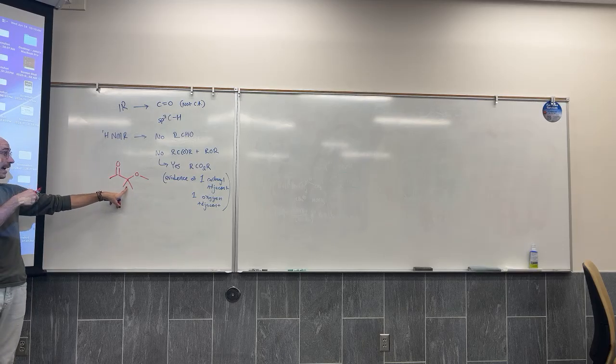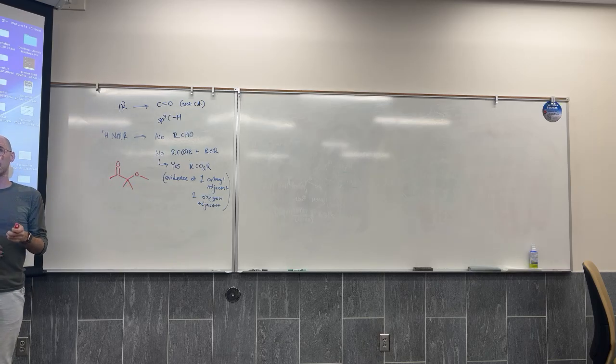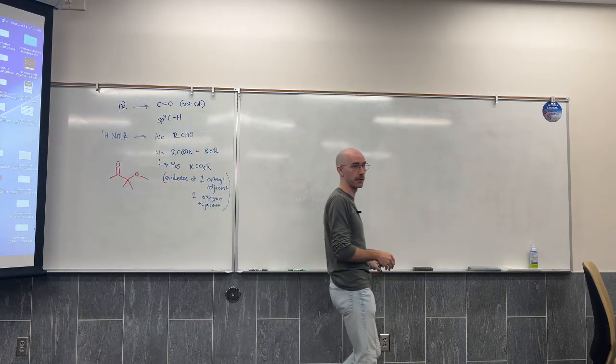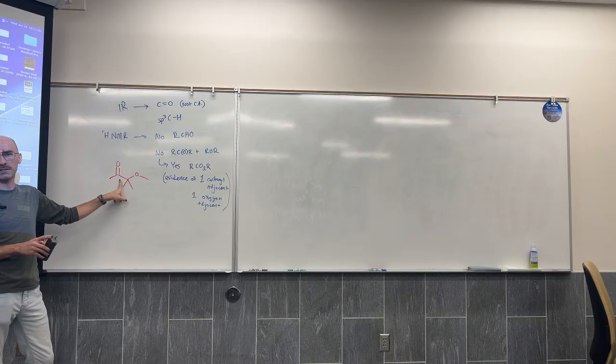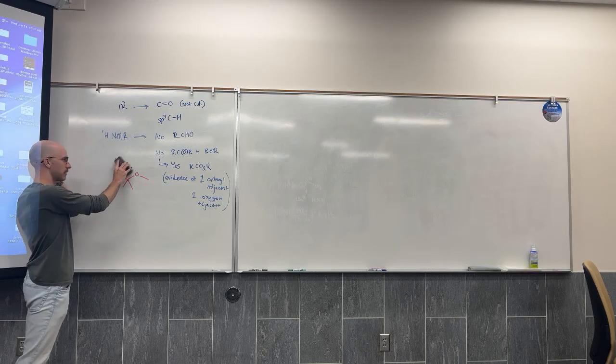And so in this case, I have a carbonyl adjacent and I have an oxygen adjacent, but we have to do some guess and check. And right now the evidence is leaning towards guessing that there's an ester and confirming that first. If I can't confirm that there's an ester structure, then maybe I'll come back to thinking about a ketone and ether where whatever is between them limits how many signals I would see.